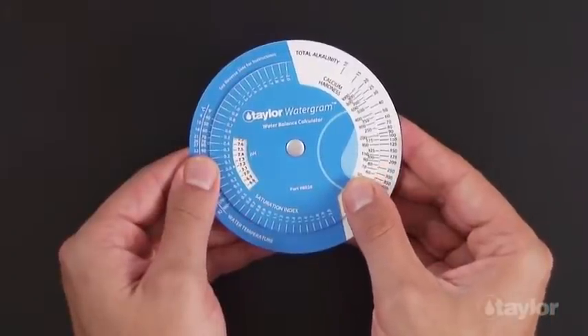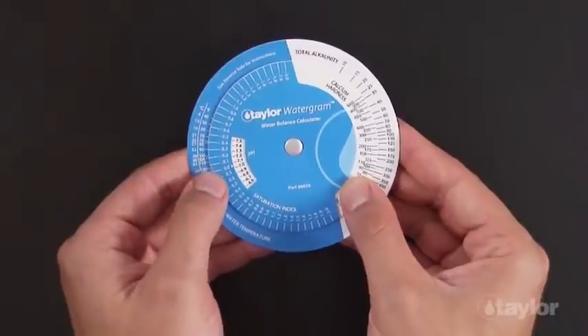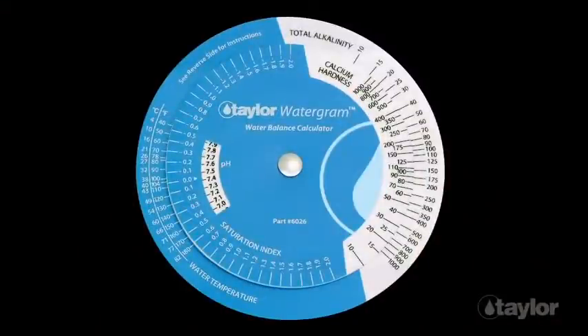The water gram makes quick work of the math needed to determine whether the water is becoming corrosive or scaling. It is a great tool for deciding which aspect of the chemistry to change when the water is out of balance. You can try several treatment scenarios before using any chemicals.